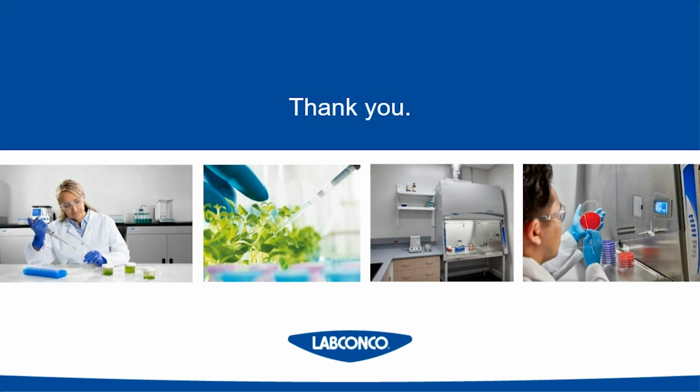Excellent, thank you. Our next question touches base on that last slide. It says, what is a Class II A2 or A/B3? That's a great question. As NSF and the organizations that regulate biosafety cabinets have progressed safety standards, some cabinets are no longer made.